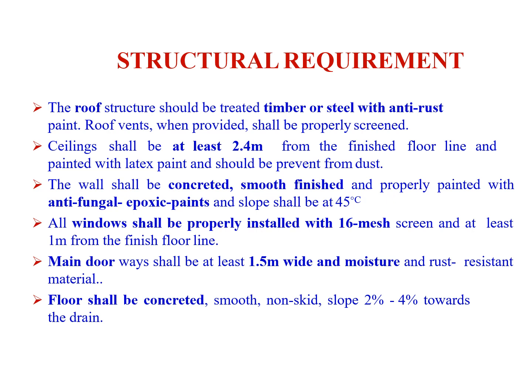The roof structure should be timber or steel with anti-rust paints. The roof vents provided shall be properly screened. The ceiling should be at least 2.4 meters from the finished floor line, as well as painted with latex paint, and should be protected from dust.